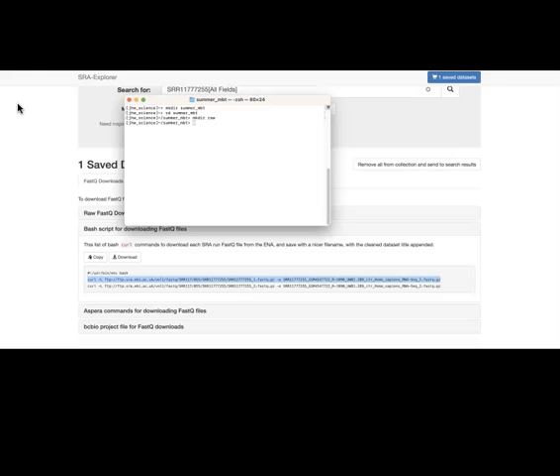You want to make sure that they are listed in a directory folder that is separate from the files that you'll be working with, because you do not want to risk the chance of these files being overwritten or deleted. So for good practice measure, I'm going to place these files that we're downloading into a raw file. So let's go ahead and cd into this raw file directory.